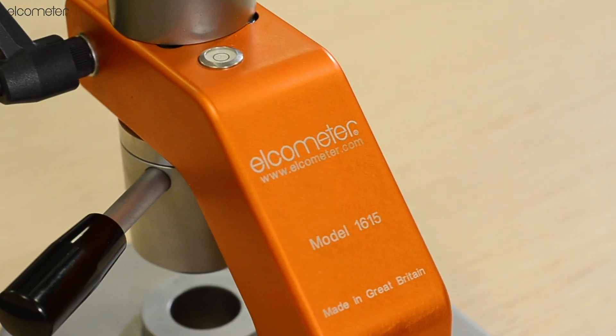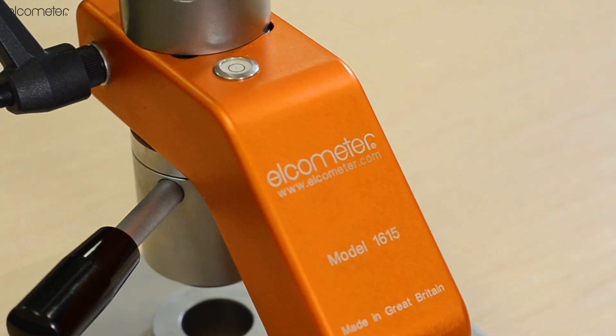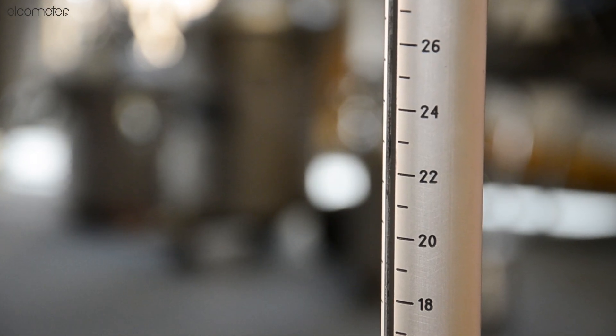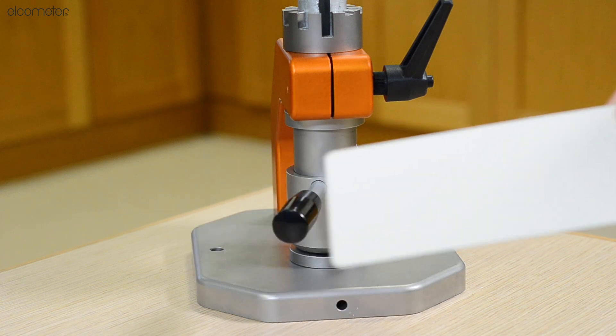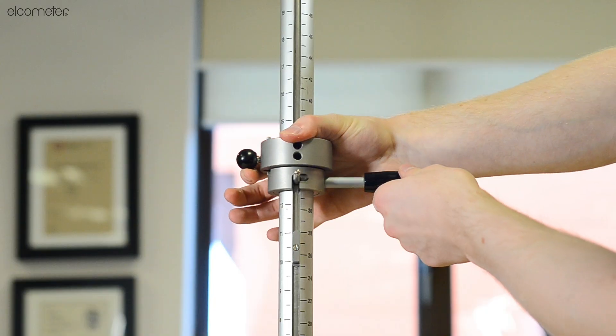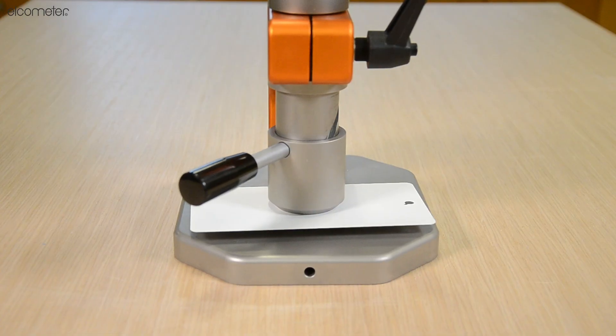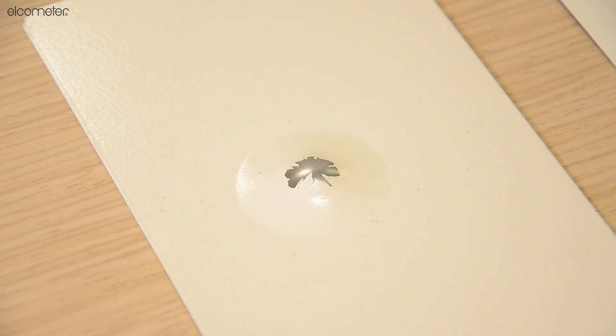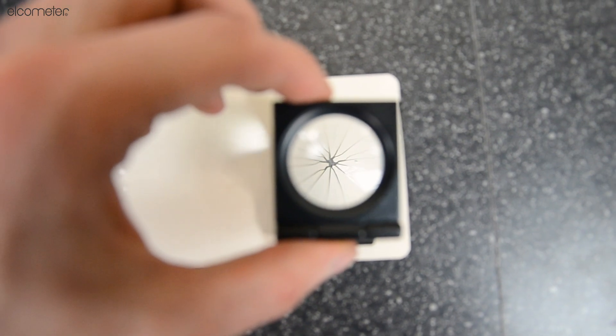The Elcometer 1615 Variable Impact Tester is a simple to use tester ideal for evaluating the resistance of a coating to impacts which typically result in the coating being elongated, cracked, or peeled.